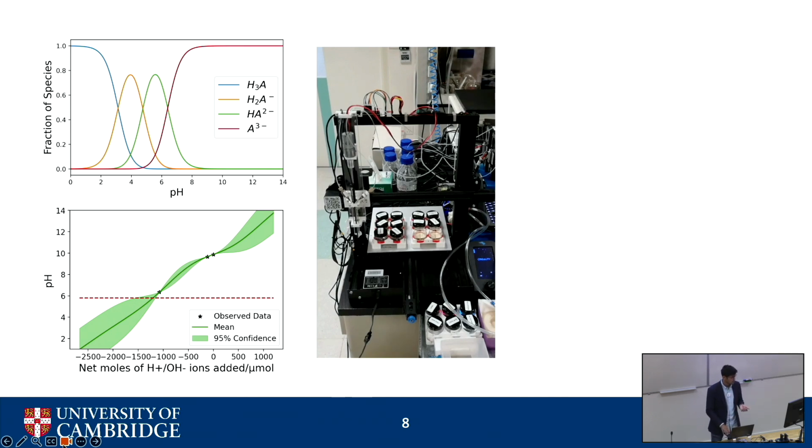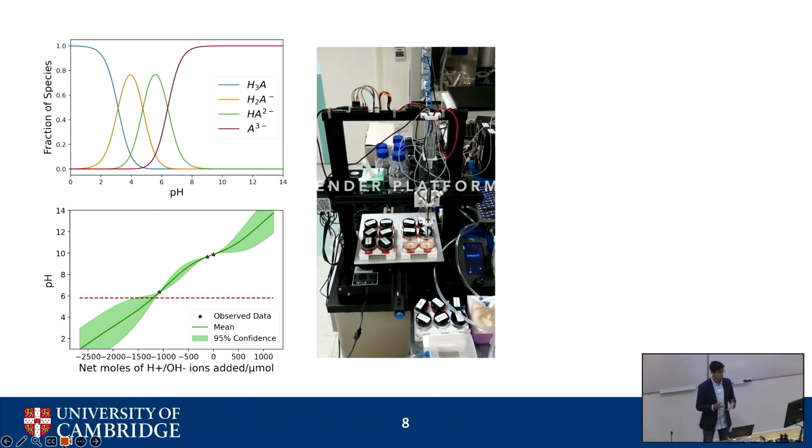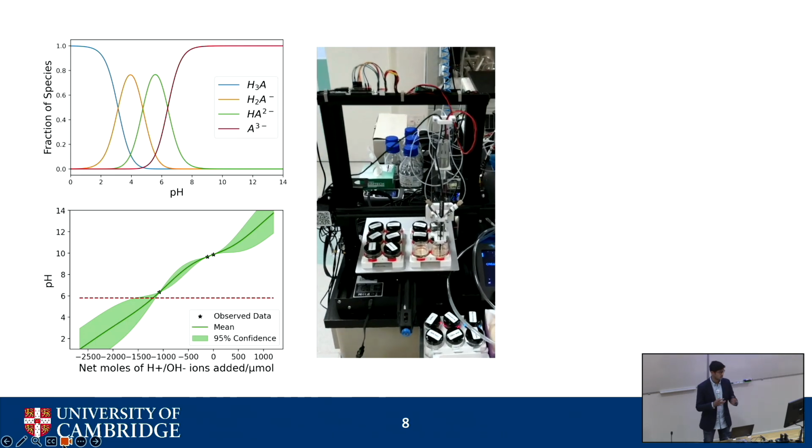I just wanted to play a little clip of the pH bot in action. So it's been built and mounted on this 3D printer platform. So essentially we had the movement in Cartesian coordinates XYZ for free.